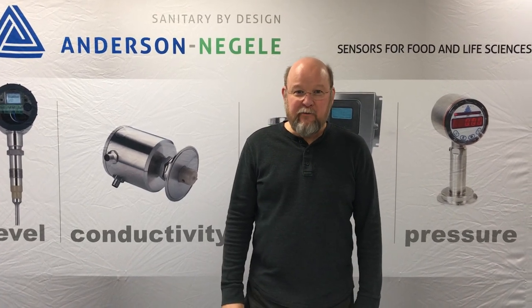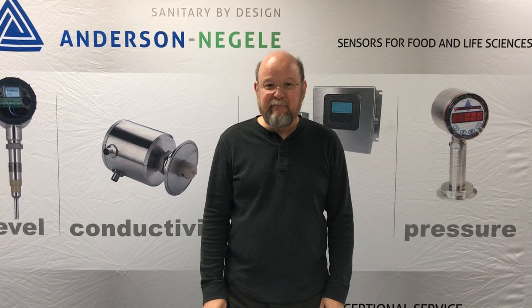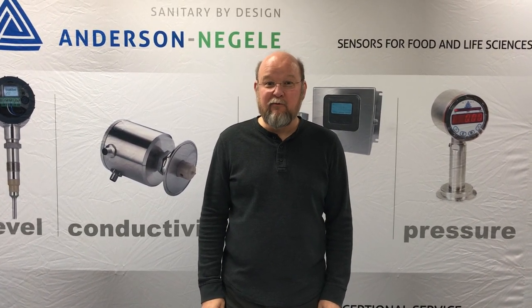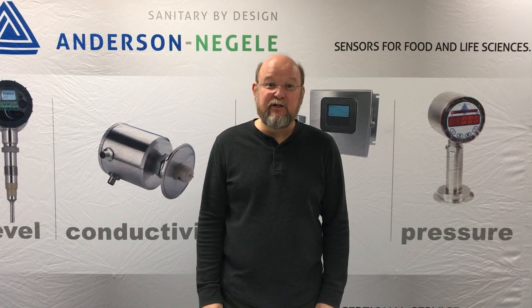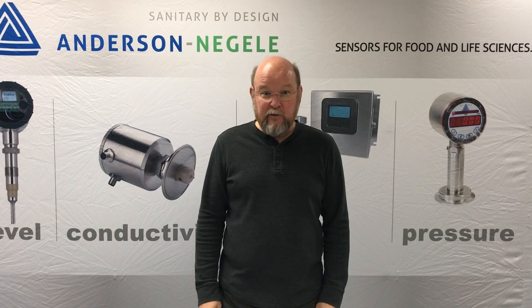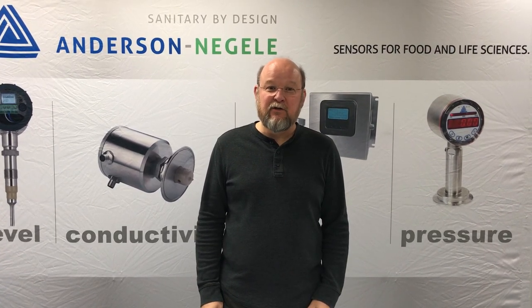Hi, I'm Bob Kysak, Product Manager with Anderson-Negele, and today I'm going to give a little demonstration on the ITM-4 and its ability to measure a very small amount of dairy product within a water stream. This is typically for the application of chilled water monitoring, where we're trying to detect the intrusion of dairy product into the cooling circuit.